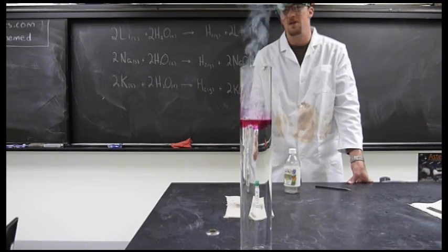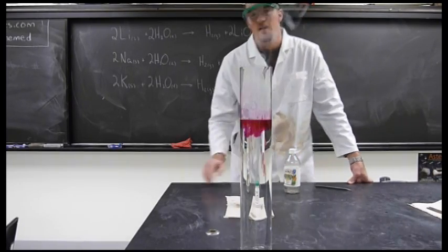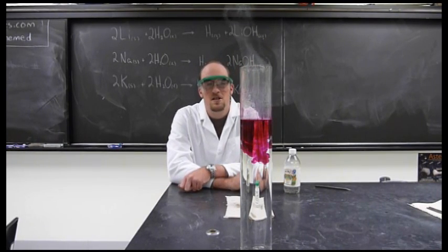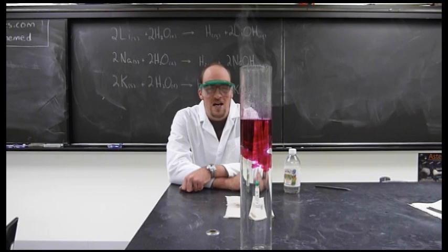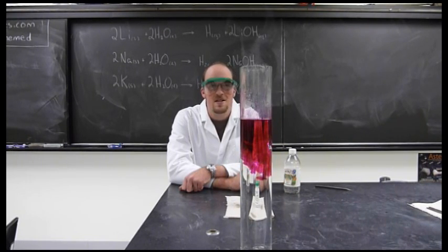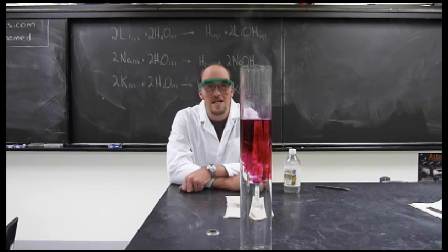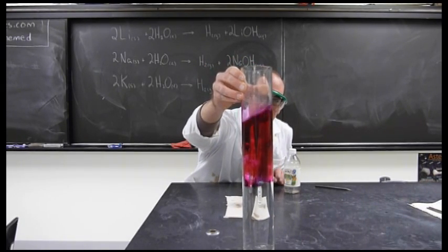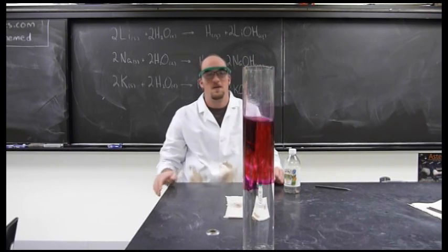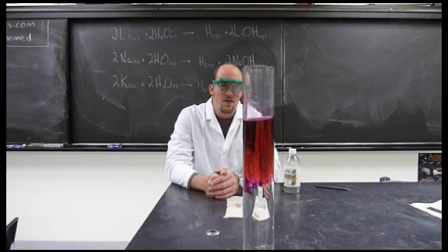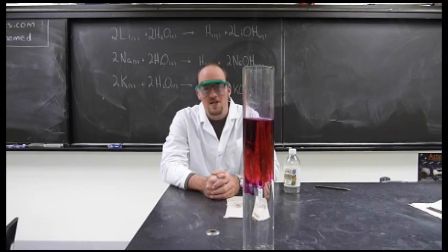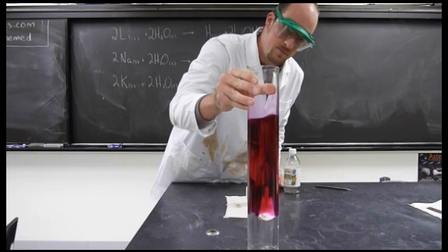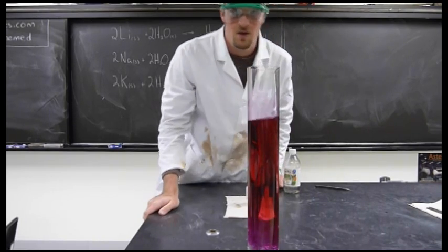What I didn't describe before that you can see here is that reaction was vigorous enough, like you saw in the other potassium reaction, to actually ignite the hydrogen gas. Another thing that comes out of this process is quite a bit of heat. So you can see the phenolphthalein indicator has really changed the color of the solution. So that means that the pH of the solution has now gone basic. Really pretty color too.